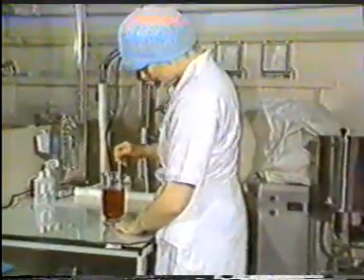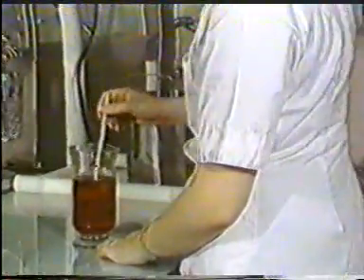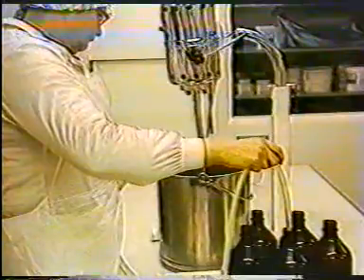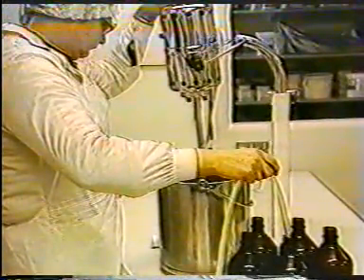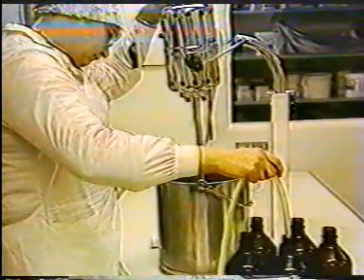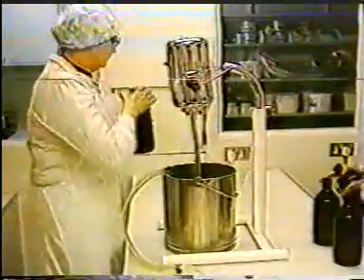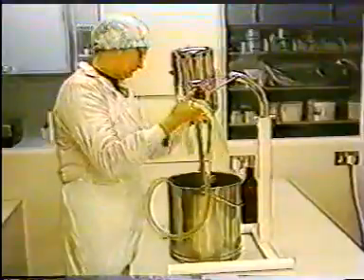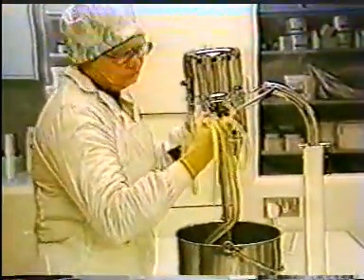Mixing should be thorough to ensure a homogeneous product. It is normally sufficient to mix simple solutions manually with a stirring rod. With more complex solutions or suspensions, mechanical mixing is required. This is an example of a mechanical mixer. It has various interchangeable heads for different applications. It is advisable to use mechanical mixing for any quantity around 5 litres or more to ensure a uniform product.